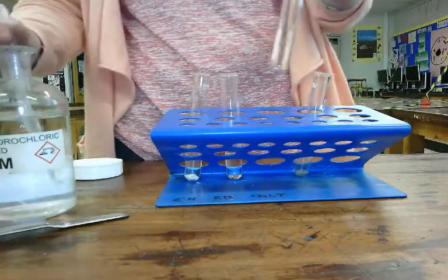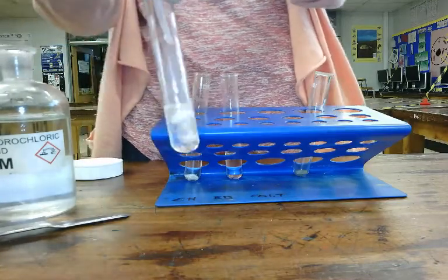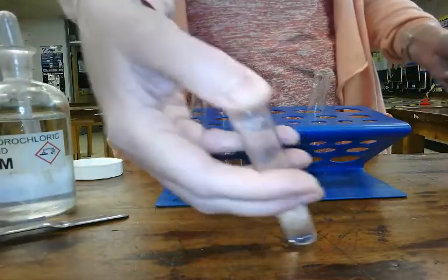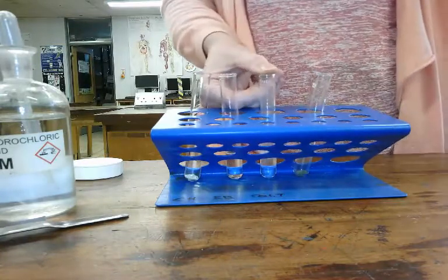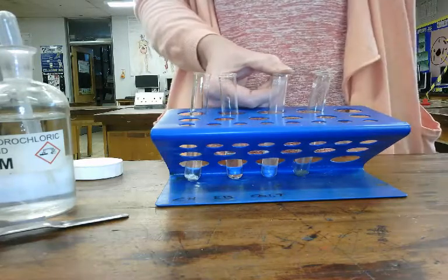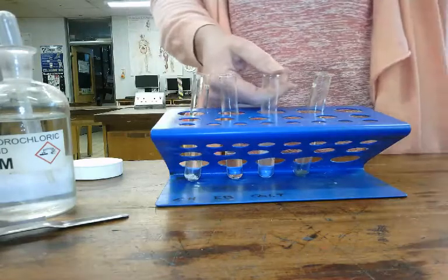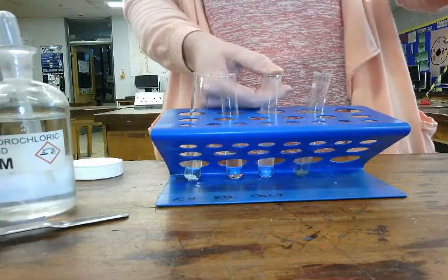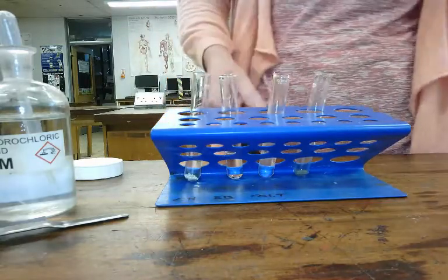The third one is magnesium. Now hopefully you can see there's a lot of fizzing there. I put my thumb over the top. I'm lighting a splint out of shot, and hopefully you can hear that pop, a squeaky pop, because it's making hydrogen gas, so it's fizzing.